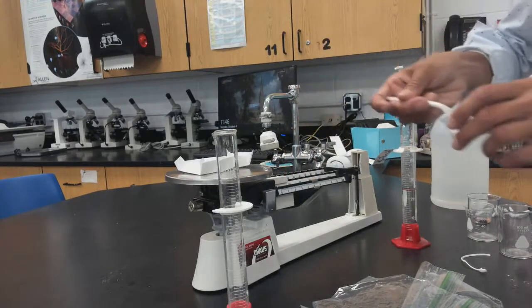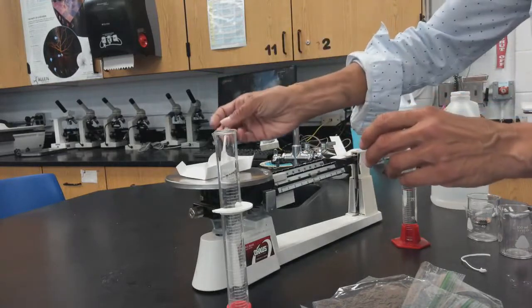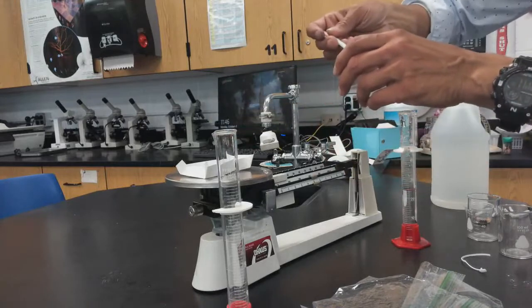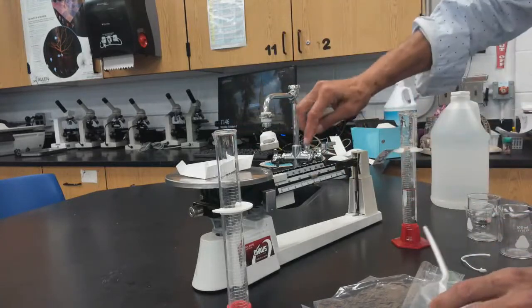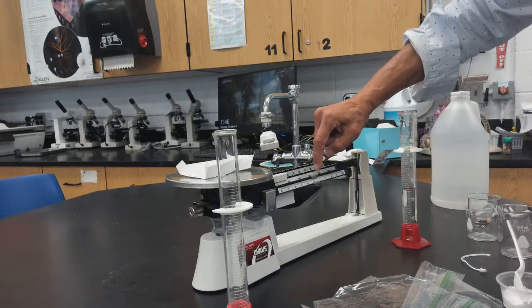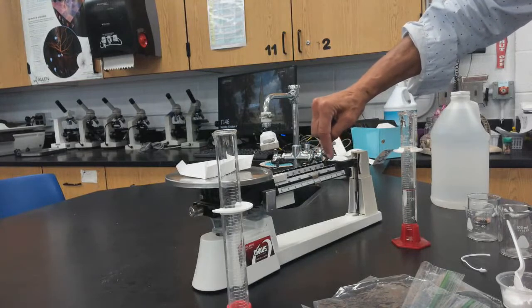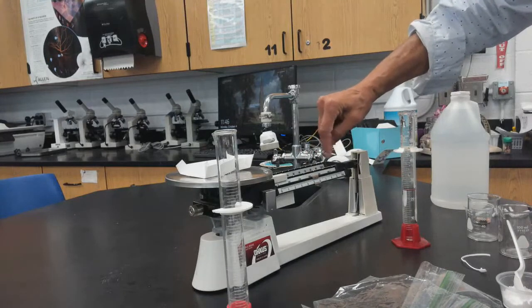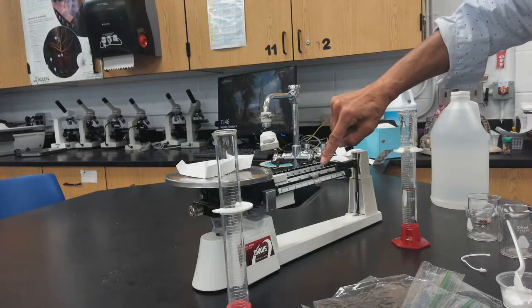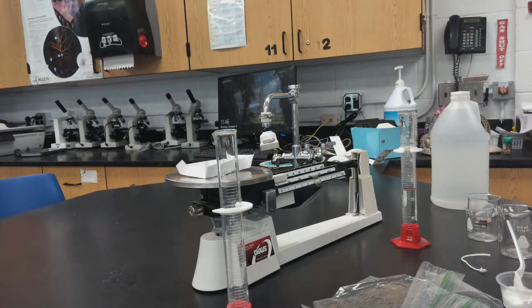I can place the weigh boat on the scale and then add the sodium bicarbonate. Instead of trying to get it exact, I'll just adjust the weight. The weigh boat was 1.1 grams, and now it reads 5.3 grams, so I have 4.2 grams of sodium bicarbonate.